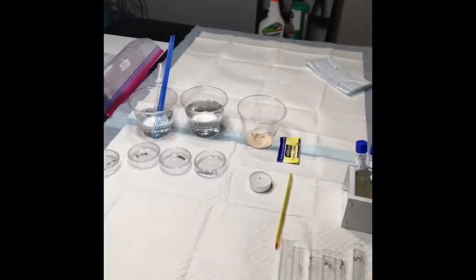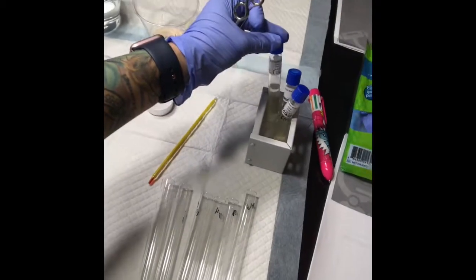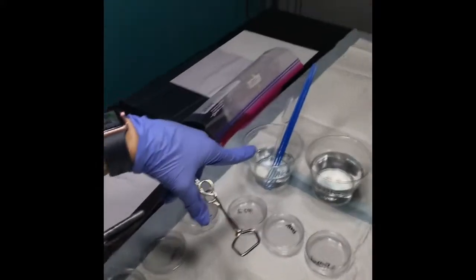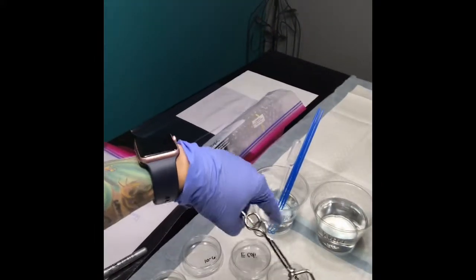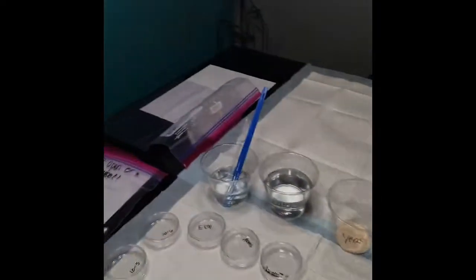Let me see if I can flip the camera. Okay, I can't. So here are my labeled tubes that I'm gonna use for the separation into the colonies. And then I have my tubes with my growths here. I have alcohol and I'm sterilizing my inoculation loops. The pipette, I have distilled water, my yeast ready to go.